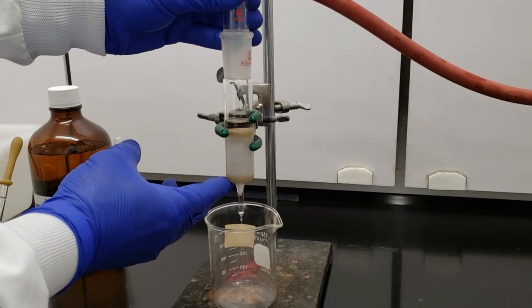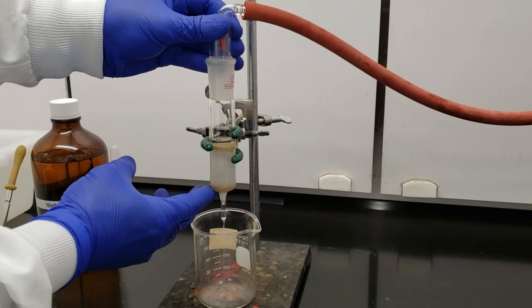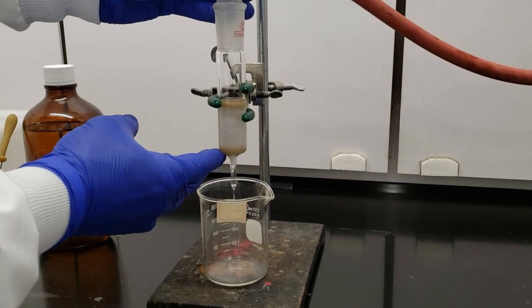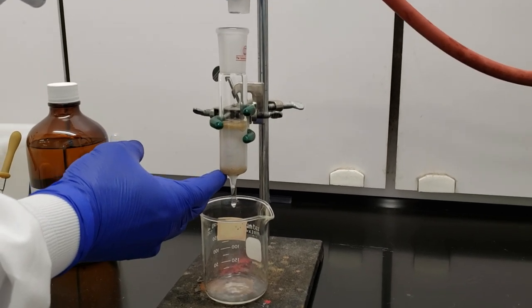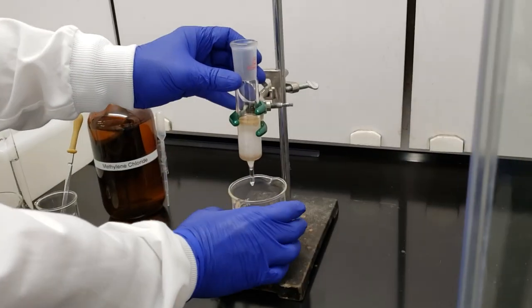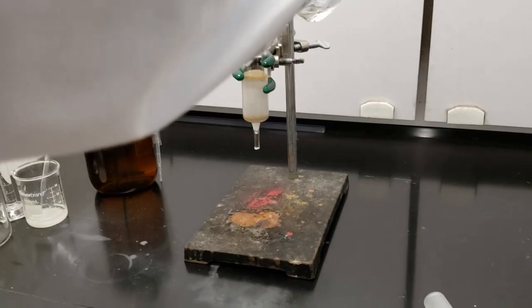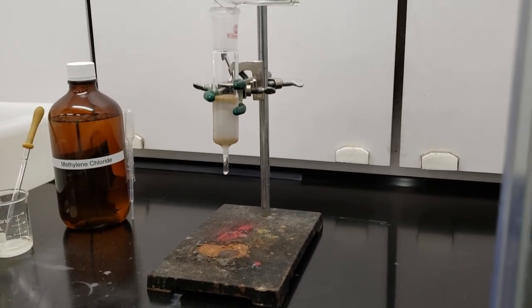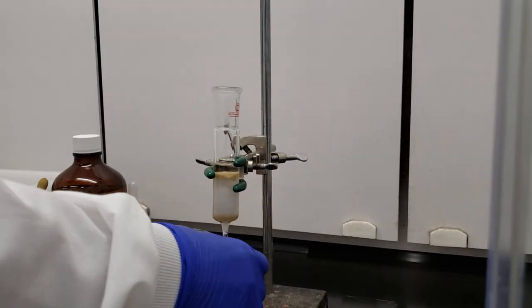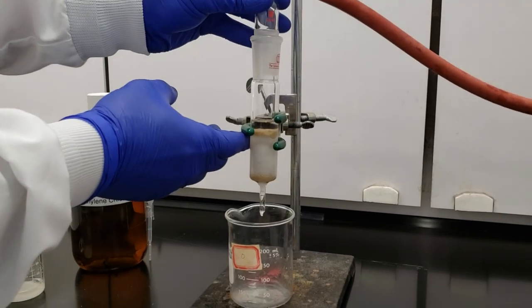You'll be able to see that solvent volume coming through at an increased rate. Now I'm not going to let my column go dry, so as my solvent volume got down towards the top of my sand, I took my air pressure off. I'm going to go ahead and pour this methylene chloride back into the top, and I'm going to pass it through the column one more time, just to make sure everything's compacted.